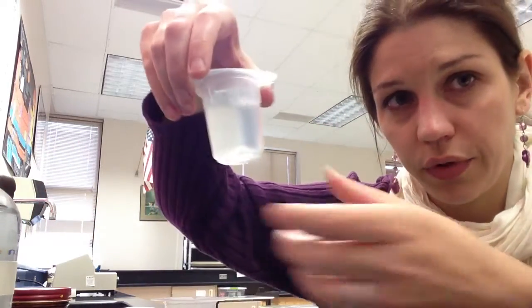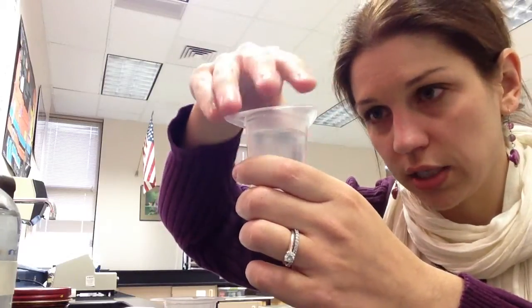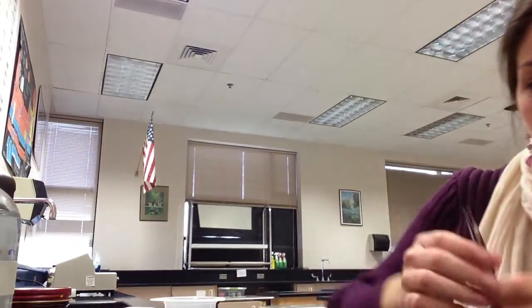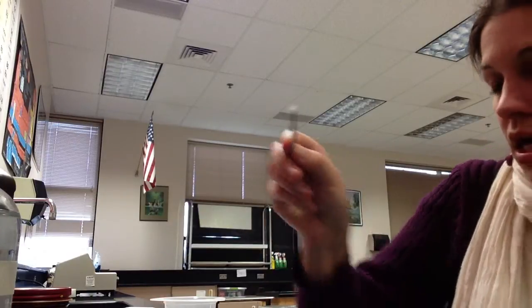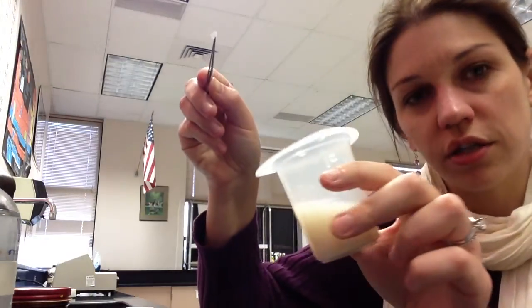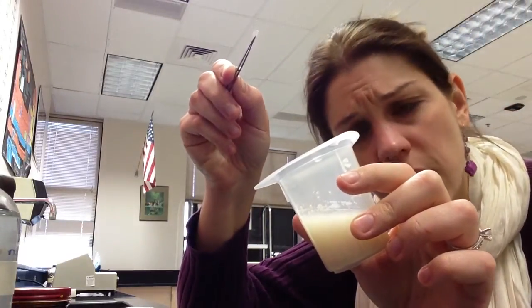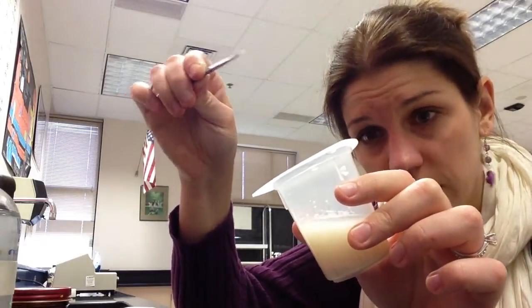So I went ahead and preloaded 1.5% hydrogen peroxide into my beaker. And then I've got my forceps, and I grab one of my discs. I will have my stock solution of yeast somewhere in the classroom. You can just pour a little bit of it in the bottom of one of the little cups. You really need very, very little of this, so just a tiny bit will get the job done.